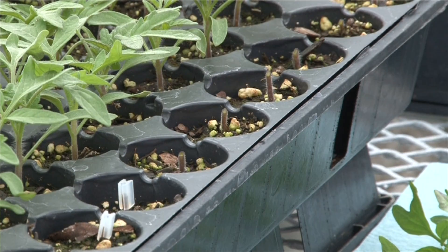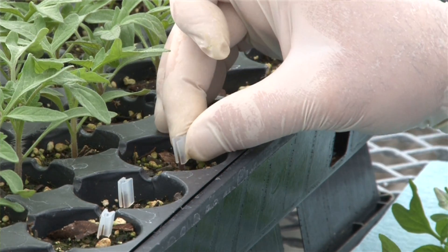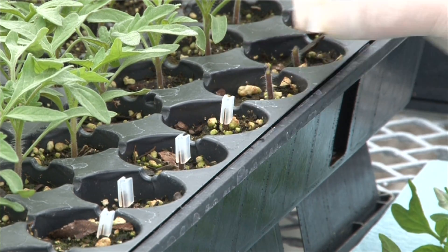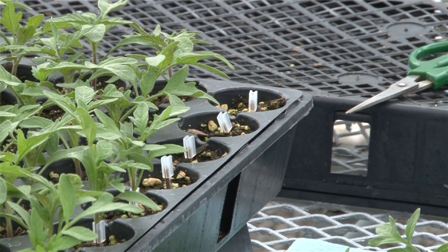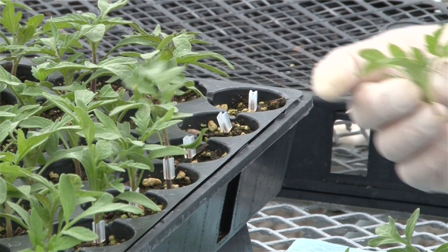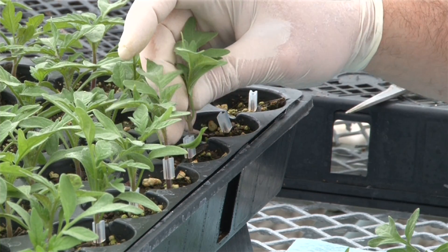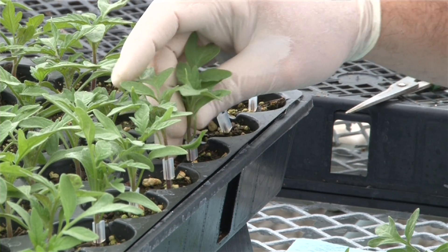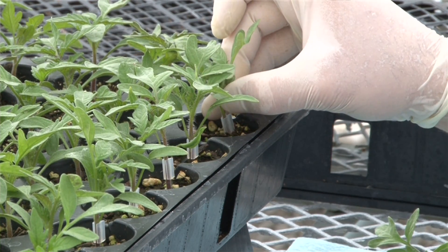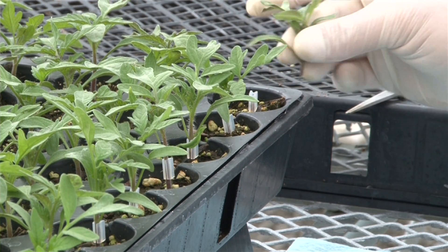It doesn't necessarily matter if the scion cut is below or above the cotyledon — oftentimes we will do it below just to make it match up better. When you're actually grafting them together, you cut the rootstock plant, put a silicon clip over the stem of the rootstock, and then insert the scion into that silicon clip. You want to make sure that those angles match up very well and you don't have any gaps at the top or the bottom. If you have plants that are mismatched, sometimes it helps to sharpen the angle a little bit to increase the surface area between those vascular tissues.